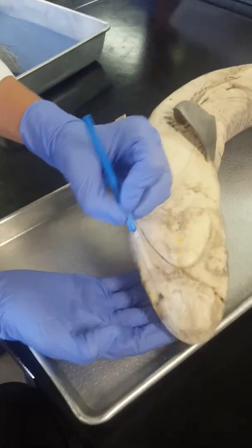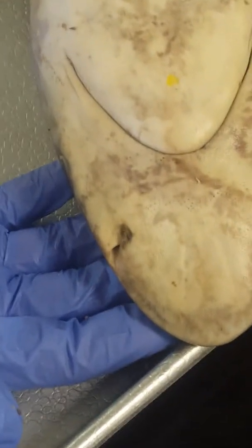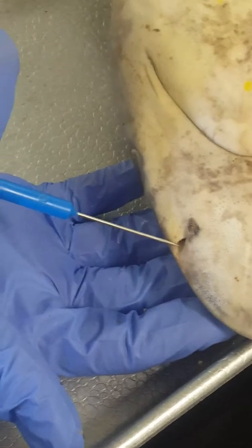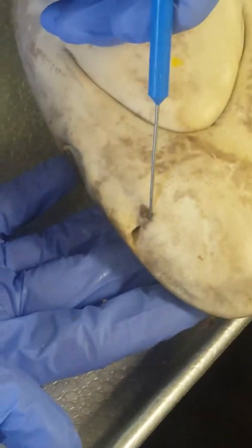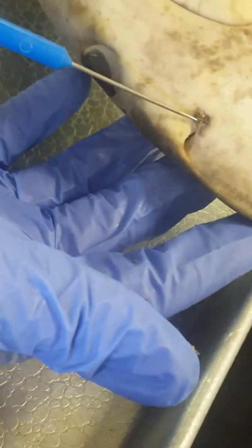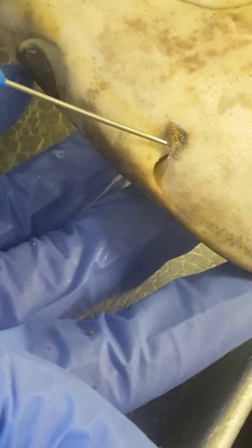Nostrils are right here. Incurrent aperture is this aperture on the outside. Excurrent aperture is this aperture on the medial side, like through here. Nasal flap is this little flap up here that I am lifting up now.